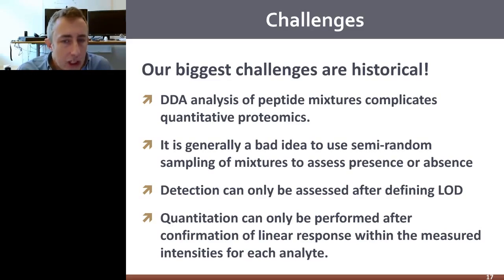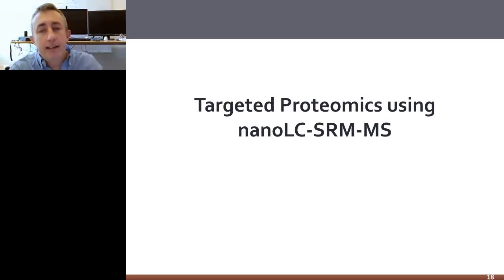we began to make some decisions and said that, okay, we actually think it's this data-dependent acquisition, starting from the top, the most intense peptides and working down, that's causing our biggest challenges. And it also creates data that's kind of semi-random, it's irreproducible, and we can say stuff about what we detect, but we can't really say anything about what we're not detecting. And again, we really struggled to do much of any type of quantitative analysis, which of course is what we were really interested in.